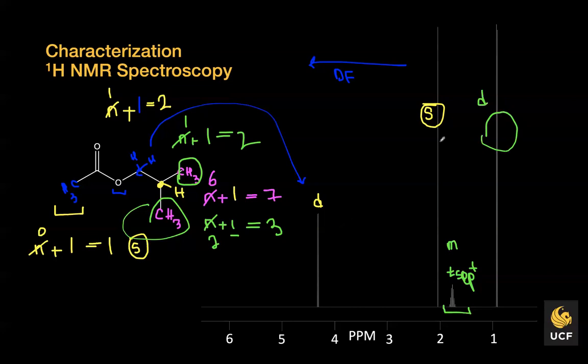So you have 2 doublets, right? Based on the intensity of the peak, the area under this peak has more hydrogen, so it would correspond to those protons, right? As opposed to those protons. And those protons are more downfield. So that's how you would assign that this is the doublet that would correspond to those protons, right?